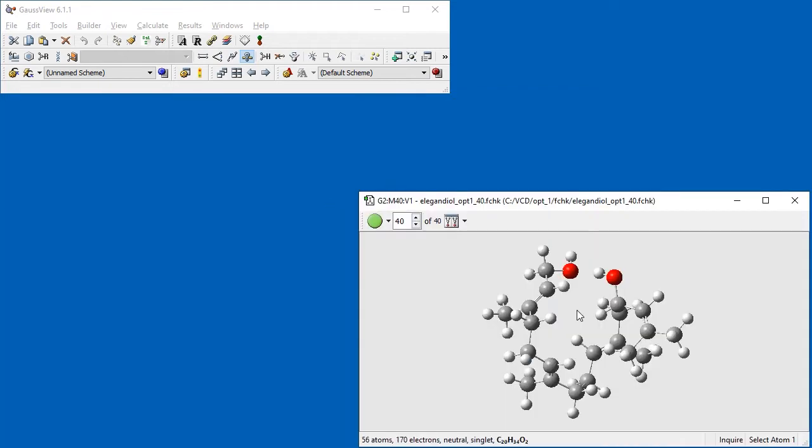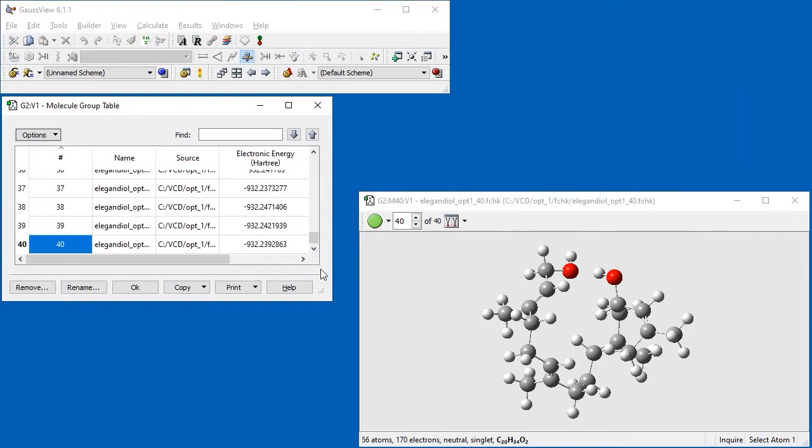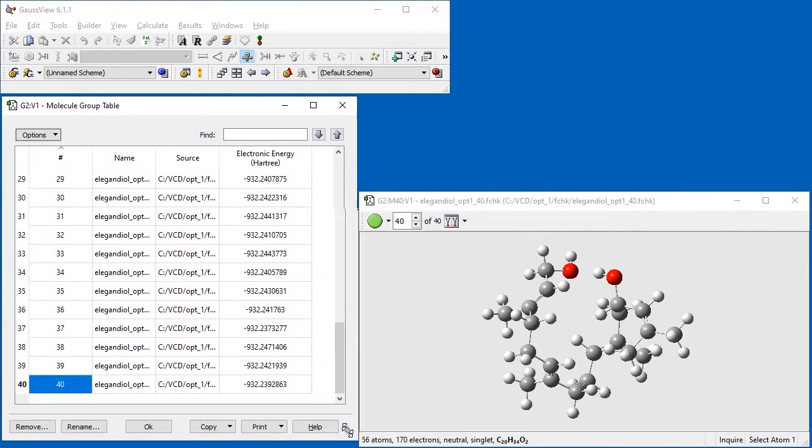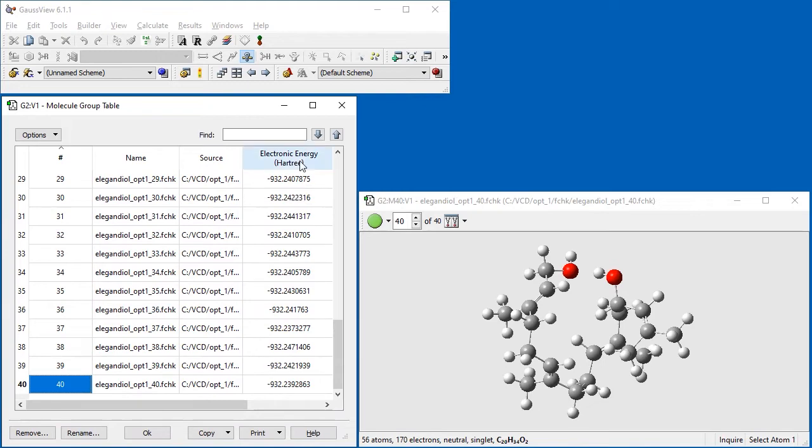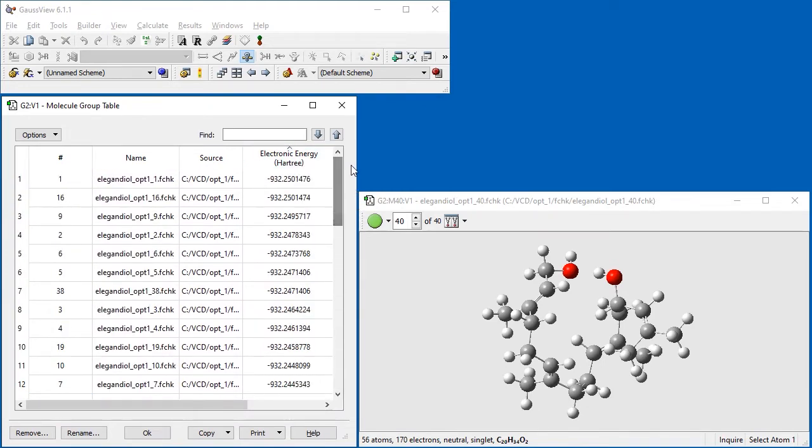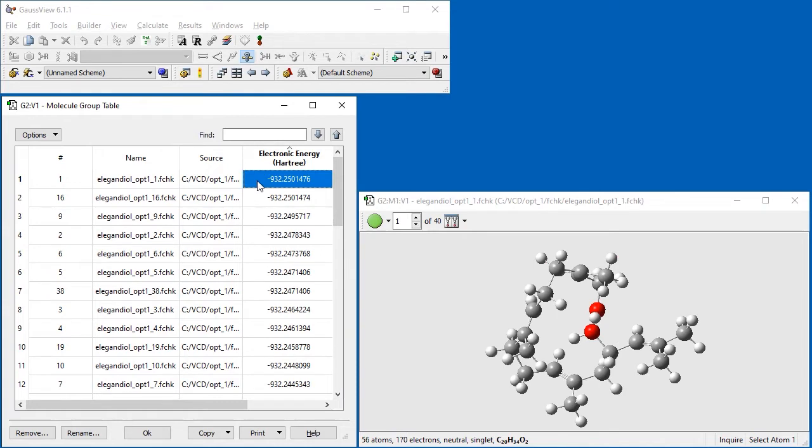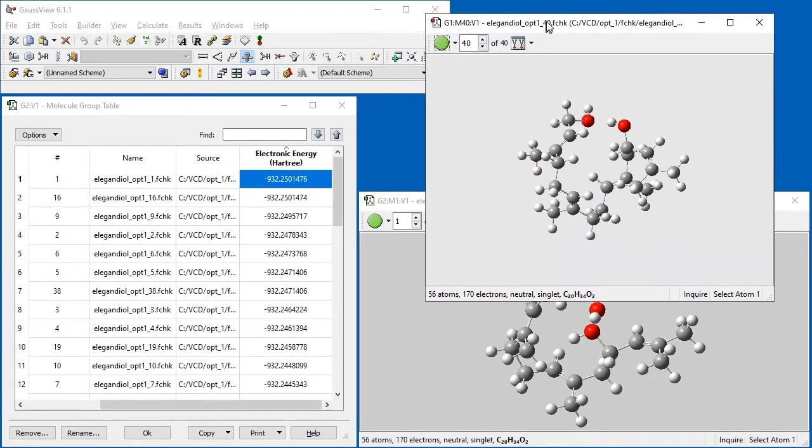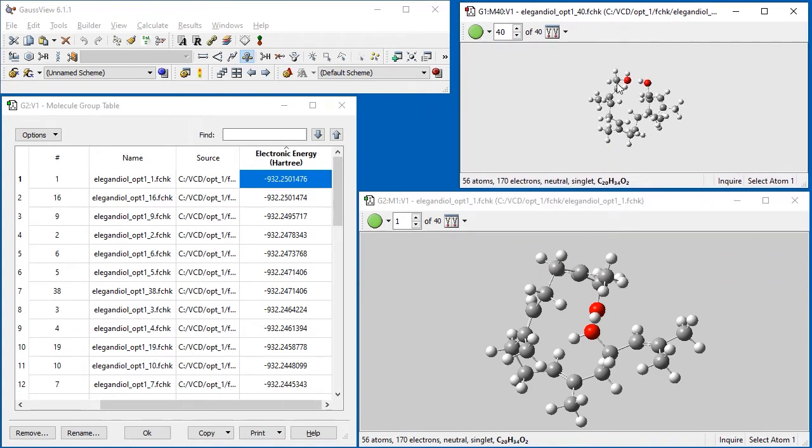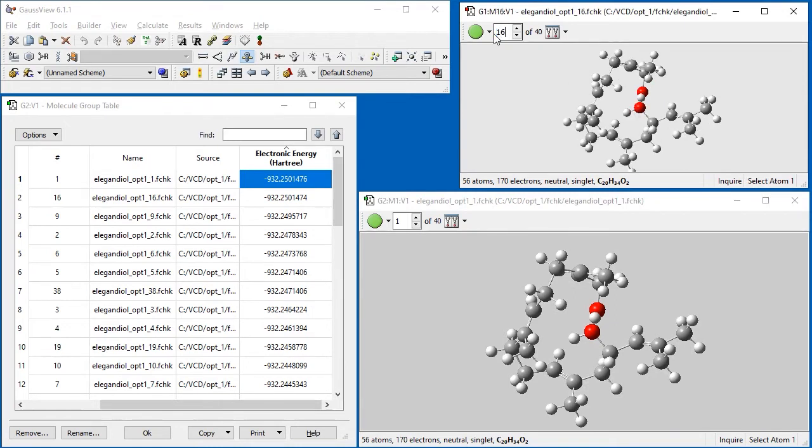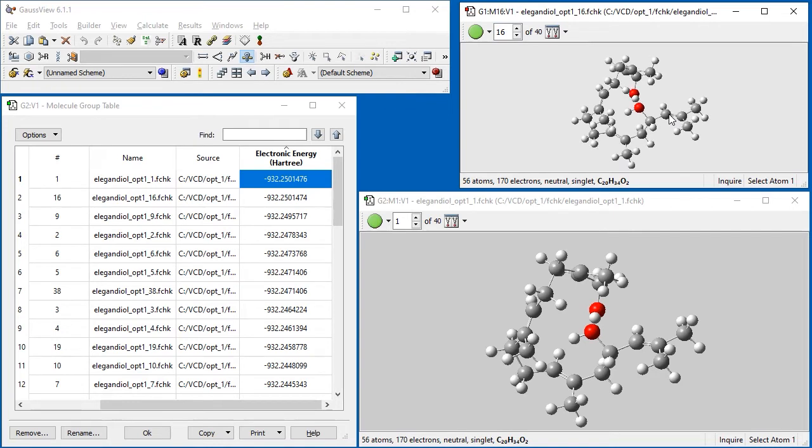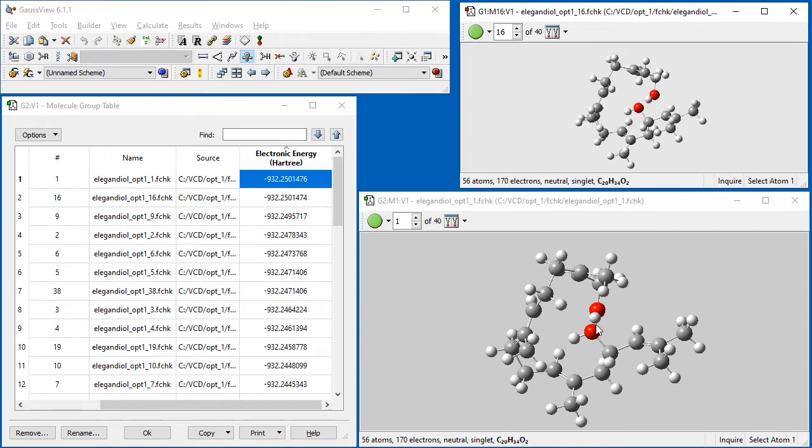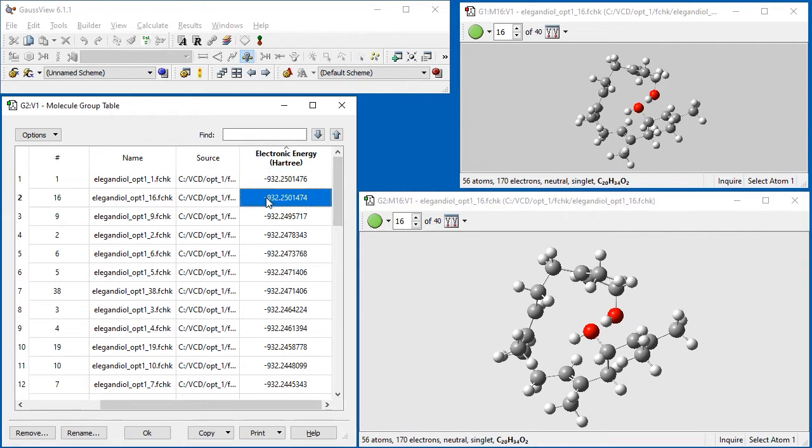Next we select Results Molecule Group Table. When the table opens, we sort the conformations by their energies. We examine the various entries to locate and remove duplicates. For example, conformers 1 and 16 have essentially the same energy. We examine and compare their structures using a second view. We can see that they are the same. We remove conformer 16 using the controls in the Molecule Group Table.